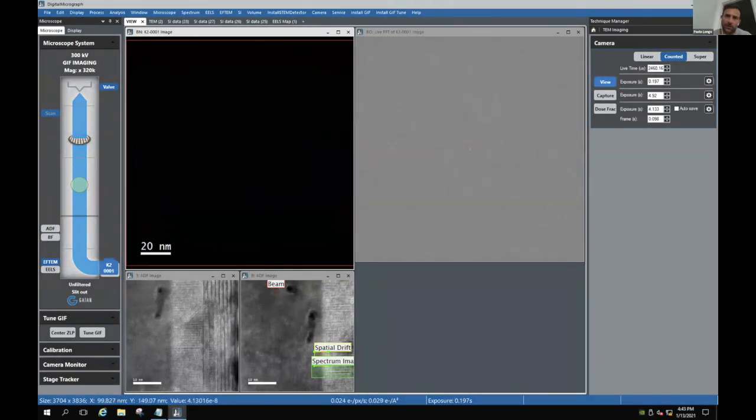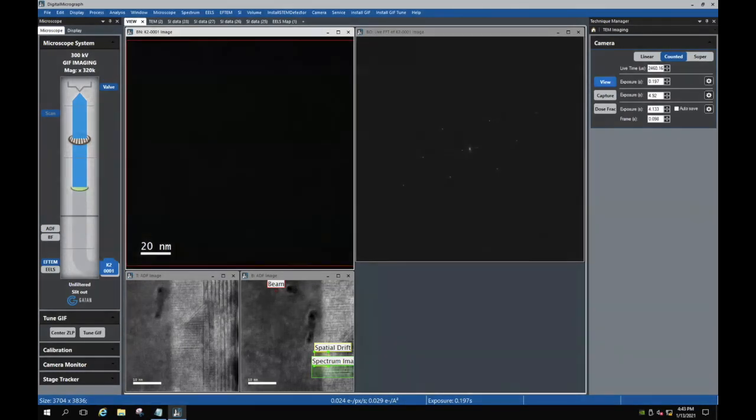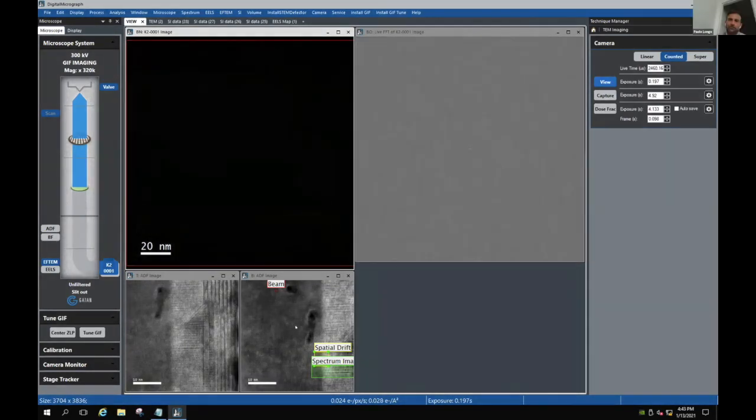So it looks like the beam changed position. Every time I change mag, it blinks the beam. Oh, okay. That's an interesting issue. Yeah, if you want to do this job, you have to make sure that the microscope is perfectly set up. You change the magnification and the beam doesn't change the illumination. The illumination stays constant.